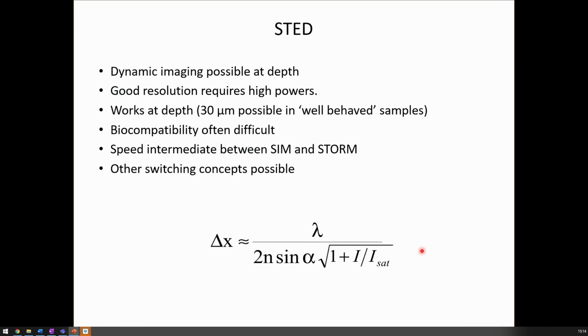And I should mention, and again, there's this work that Stefan Hell is pushing very hard in his research group, that it doesn't really matter whether you use stimulated emission to deplete the upper state. All you need is a distinguishable state. So you need to just be able to distinguish the excitation state from the emission state. If you can do that very clearly, if you have some other mechanisms of switching the fluorescence, you could switch the color, you could switch the intensity in other ways than you do with depletion. That is all possible. You would still get the same physical principle.